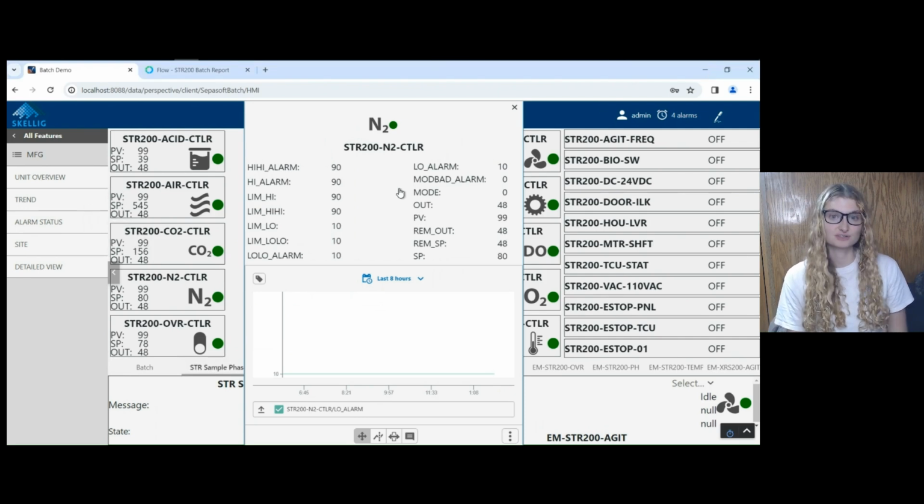Even though our batch is over, we actually have some more use cases to go over that can help the end user. Now, if we come back to the HMI, remember our little faceplate here? This guy is actually displaying historical data from Canary. This might look similar to what you've seen before, but I promise it's actually quite different. In the 3.0 facility, my historian was manually linked into every tag within that control software. To view the trend, you either viewed it within that control software or within the historian.